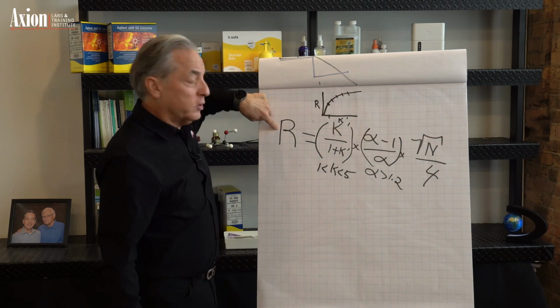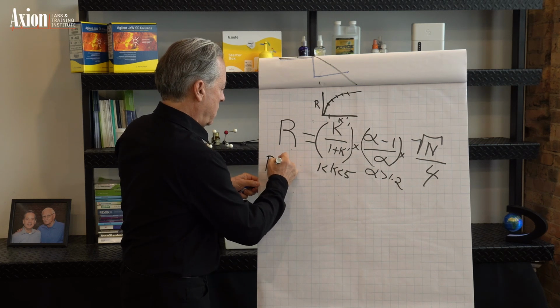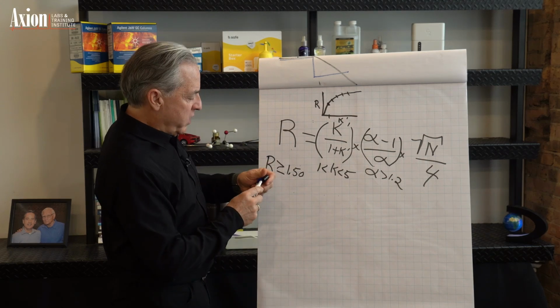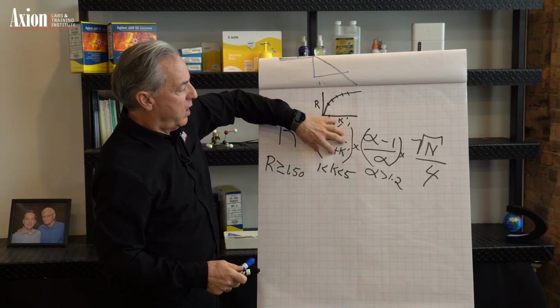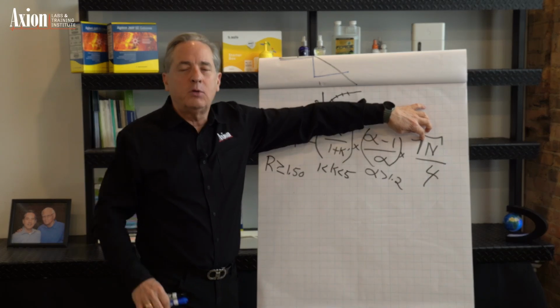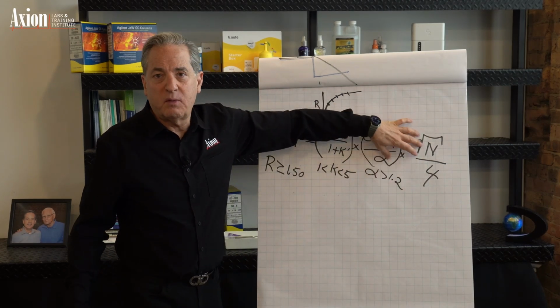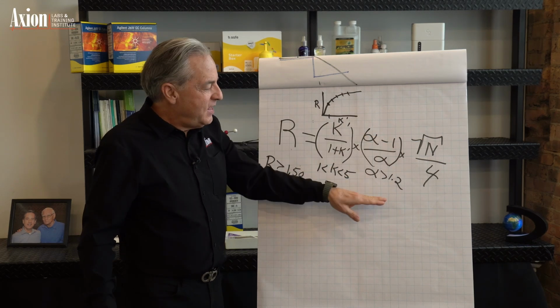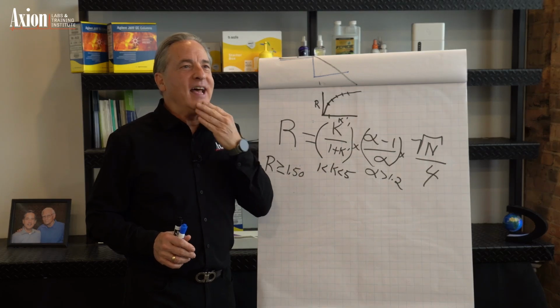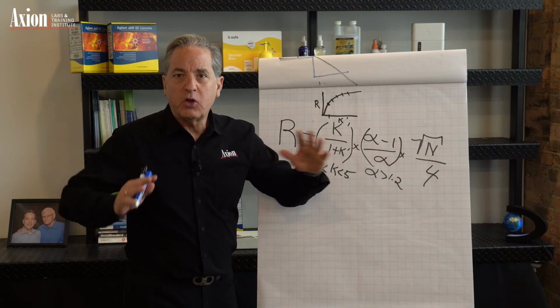So in order to get resolution of 1.5, that's our goal here, resolution greater than 1.5. If that's our goal, we know that capacity factor tops out, right? Once you get this term to 1, it doesn't get any better than that. We know efficiency in LC. We can get 30,000 plates, but we don't have 300,000. Sorry, not going to get it in LC. So I believe selectivity really comes from that back calculation, saying, you know what, in LC, you better have chemistry. You better have enough chemistry to give you a 1.2. I look at that as, to do 20% of the separation, you better have some chemistry, and we'll take care of the rest with our skinny peak thing.